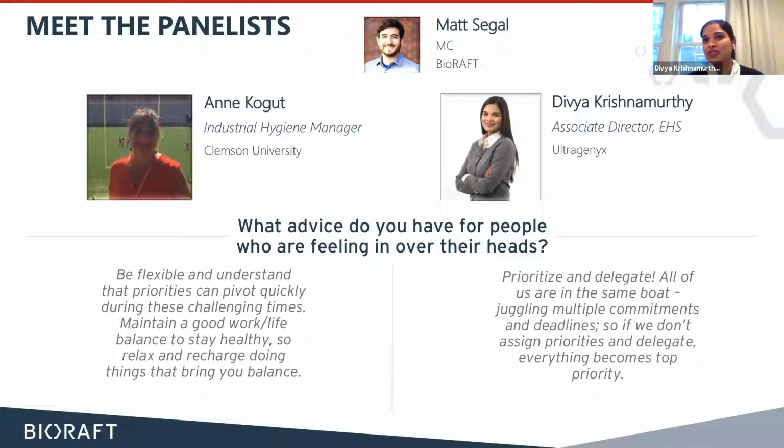So right now, from an operations perspective, it's a good time for cleanouts. I don't know if this is necessarily efficient, but this is what worked, honestly. We literally left two bins, saying that if you have acid waste, or chemicals that need to be disposed of, leave them here. Then you come back at the end of the week, and half of the chemicals in the lab are ready to be disposed of.